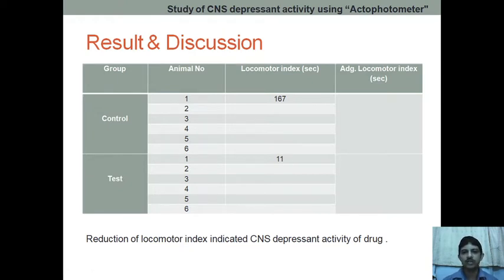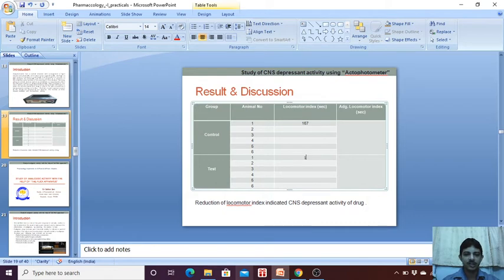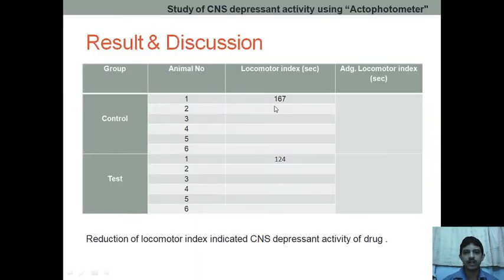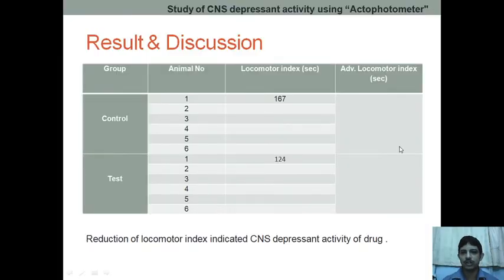You are going to observe the locomotor activity — for example, if the count is 124, you write it as 124. You check each of the six animals one by one and then calculate the average locomotor index.